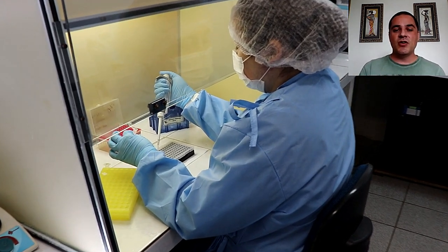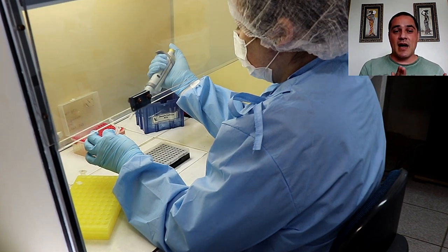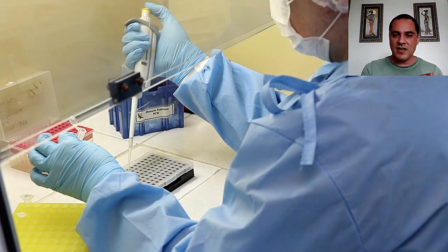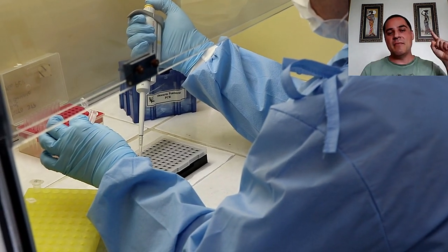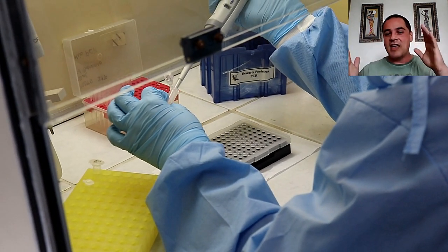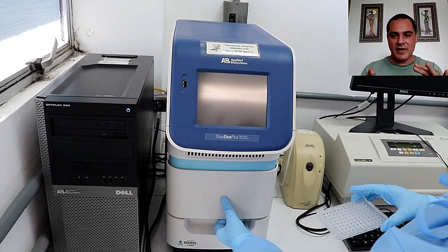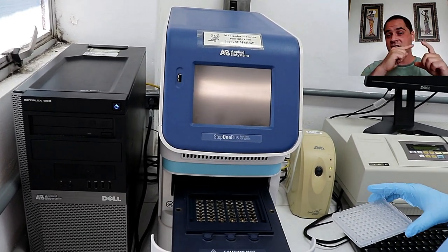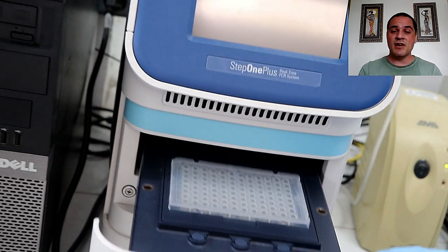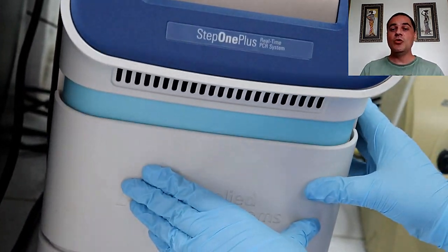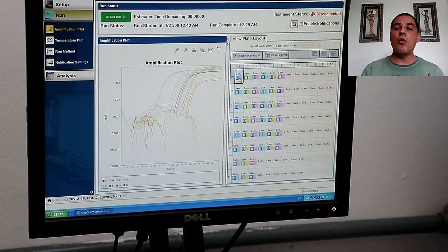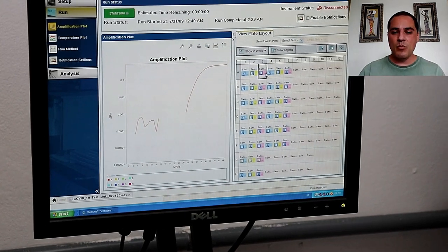Vejam nesse vídeo a professora Gislaine preparando uma placa para detecção de coronavírus. Ela está pipetando as amostras do paciente com os reagentes, lembrando: controle das reações, controle positivo, controle negativo e a amostra do paciente nos poços 1, 2 e 3 e assim por diante. Ela vai colocar essa plaquinha — que permite o diagnóstico de várias pessoas ao mesmo tempo — no termociclador de PCR quantitativo em tempo real. No computador, a professora Gislaine já tem acesso ao resultado, porque ela faz esse monitoramento em tempo real.